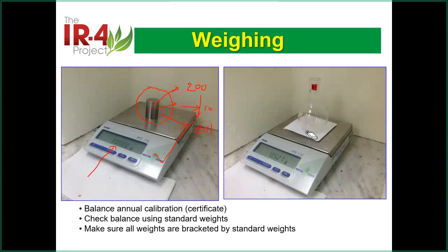It's not a requirement, but it's good practice, because this kind of label can sometimes be peeled off, or sometimes you have solvent drop on the label and it's difficult to read. If you lose both of them, the identity, it's not so likely to happen, but this is what I do. It's not a requirement, it's good practice.